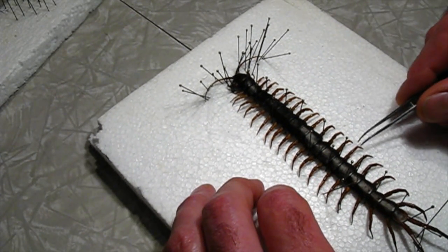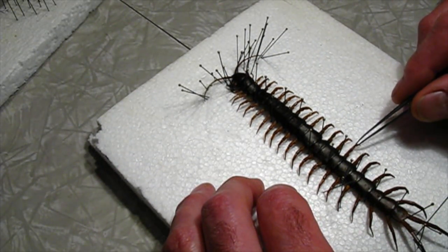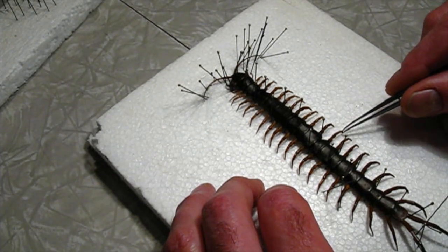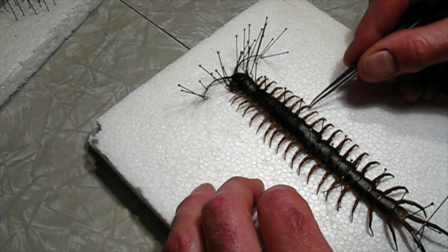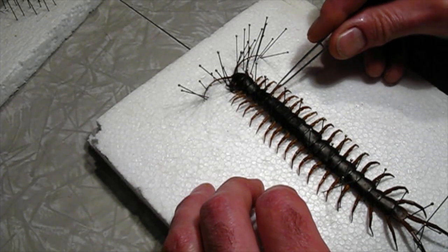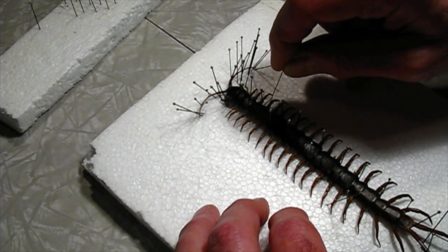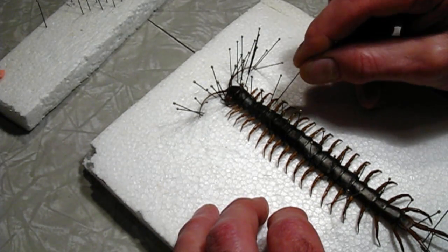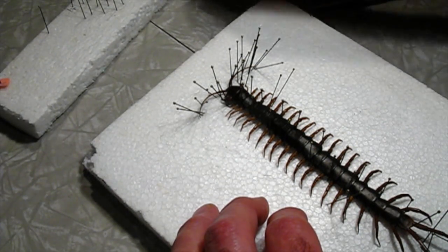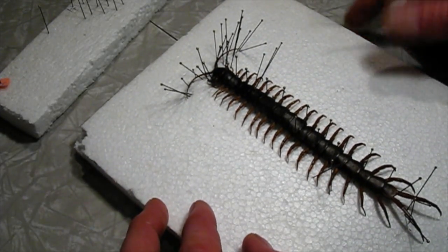I'm just going to work these a little bit more to get a little curvature on them. The tips of these legs are very sharp, and it sinks into the styrofoam nicely, and that helps hold it in place. And when I pick it up, once it's dry, they'll just come right out of there. Here, this one's a little crooked. I'll have to use a pin on that one. Straighten it out. There. Okay. And we'll just set this and let it dry.